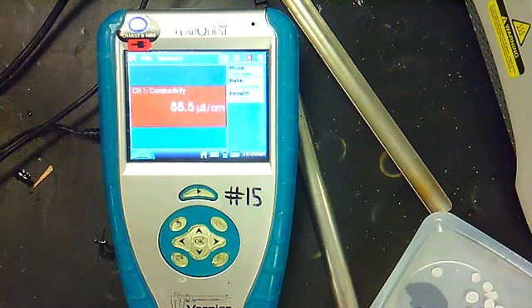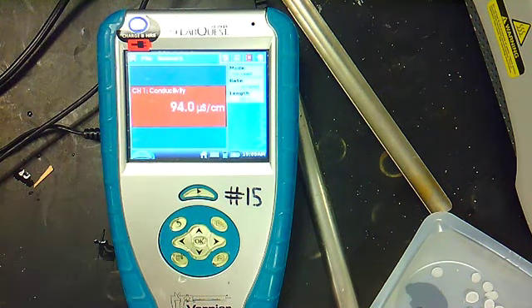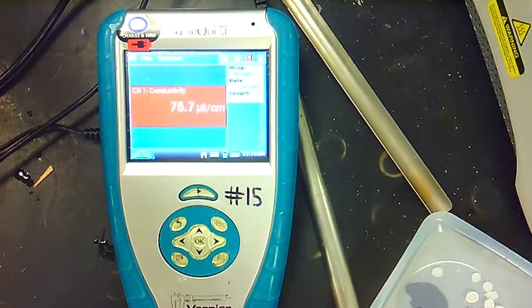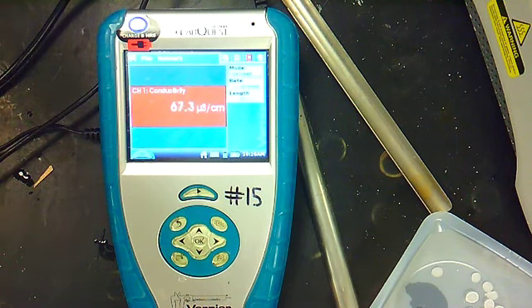That doesn't seem to have worked the way it was supposed to. So let me check that out. All right. Let's try the third compound. Okay. So the third compound is conducting as it's supposed to. Okay. I'm going to pause the video, and I'm going to come back to compound B. Okay, so you got compound A, which was around 300. Compound C is about at 63. Let's do compound B again.